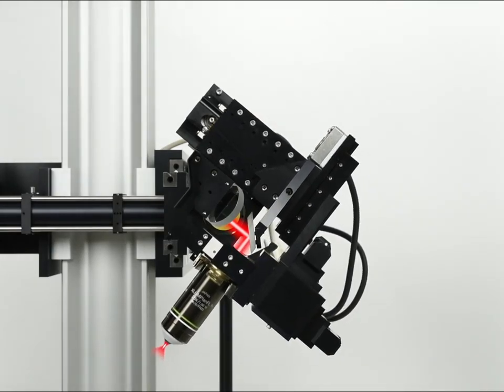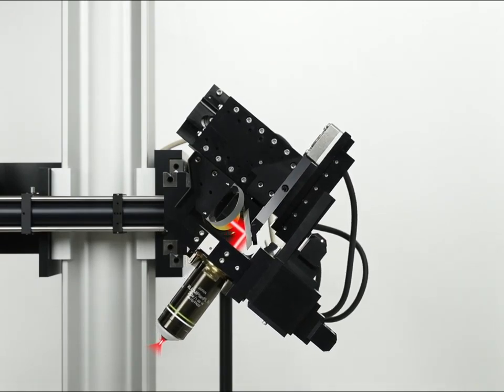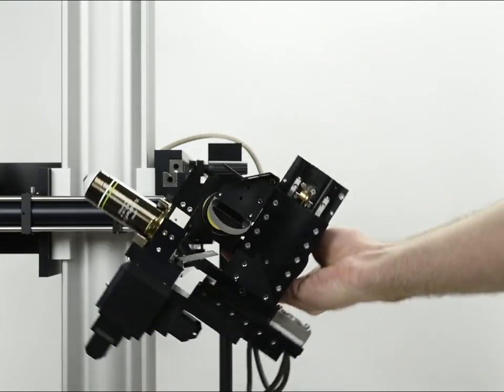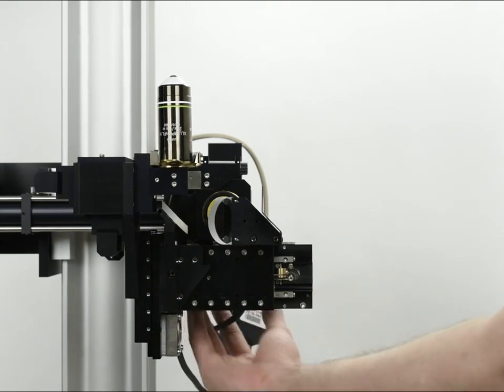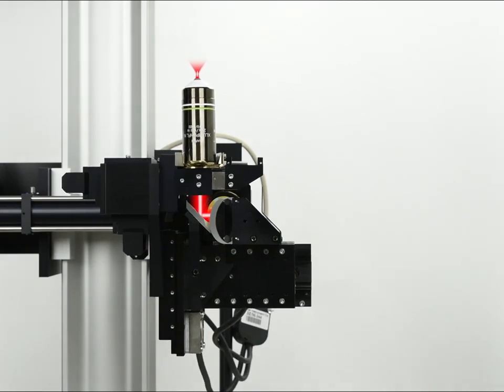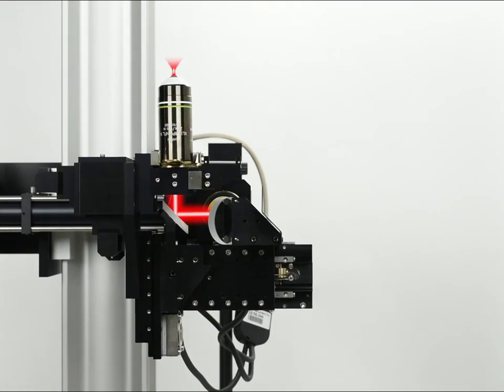This allows for imaging surfaces that are non-orthogonal to the microscope, to the table surface, for example. And you can take that to the extreme and simply convert your upright microscope to an inverted microscope. This might be important for embryologists, for example, people who are looking at things developing in a petri dish over time.